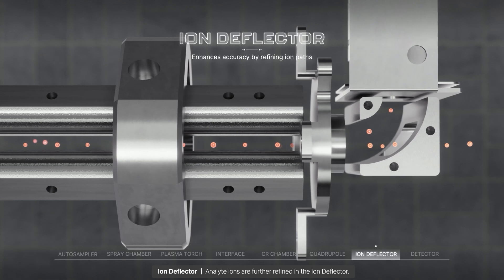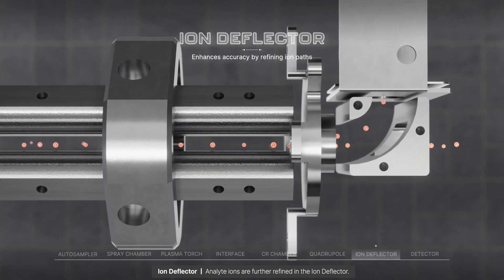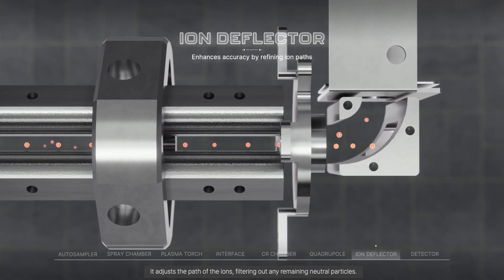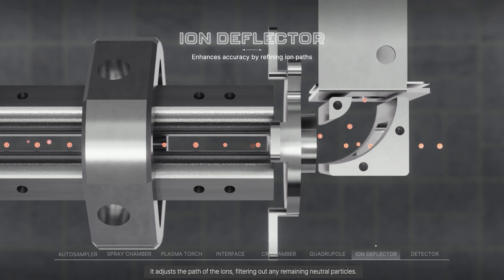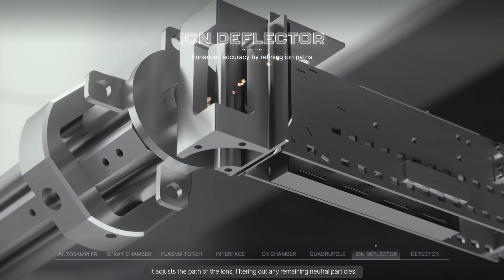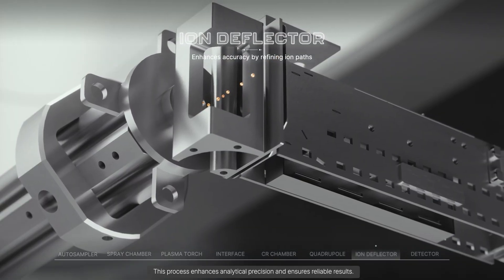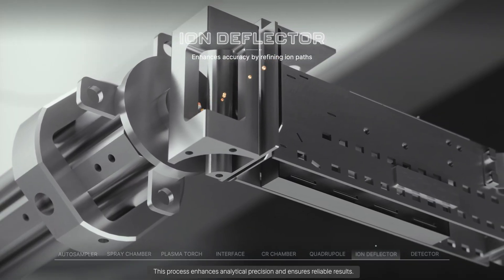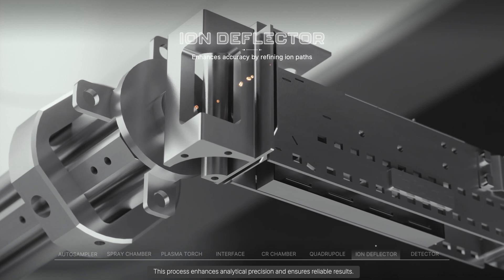Analyte ions are further refined in the ion deflector. It adjusts the path of the ions, filtering out any remaining neutral particles. This process enhances analytical precision and ensures reliable results.